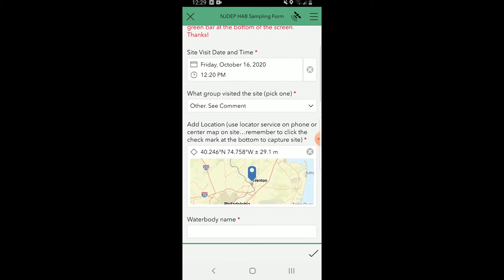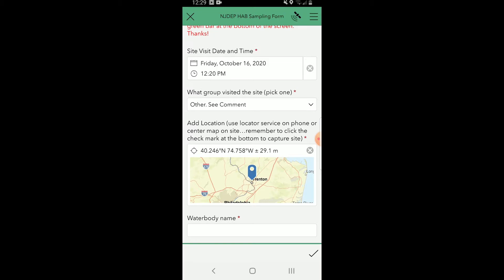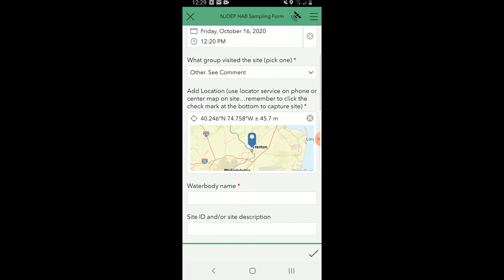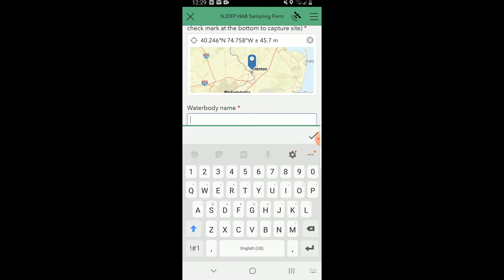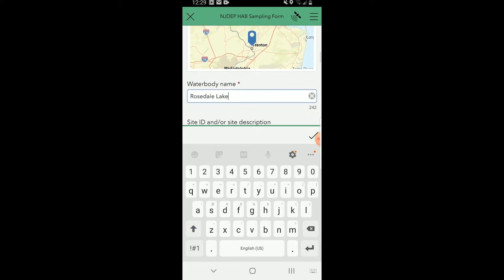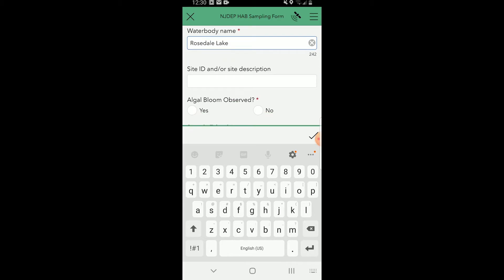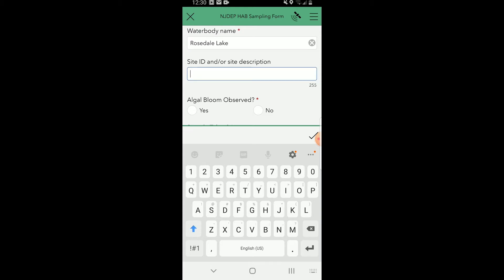Generally many of you will be parks or other. If you're not on the list, press Other and you'll get an opportunity to fill in your organization in the comments. Next, add your location — press the crosshair button and it will give you your exact location. Then write down the water body name; for example, Rosedale Lake — always use the full name, never just Rosedale. Then fill in the site ID or site description. We will generally provide a site ID, but if you don't have one, write the site description, such as the boat launch at Rosedale Lake.